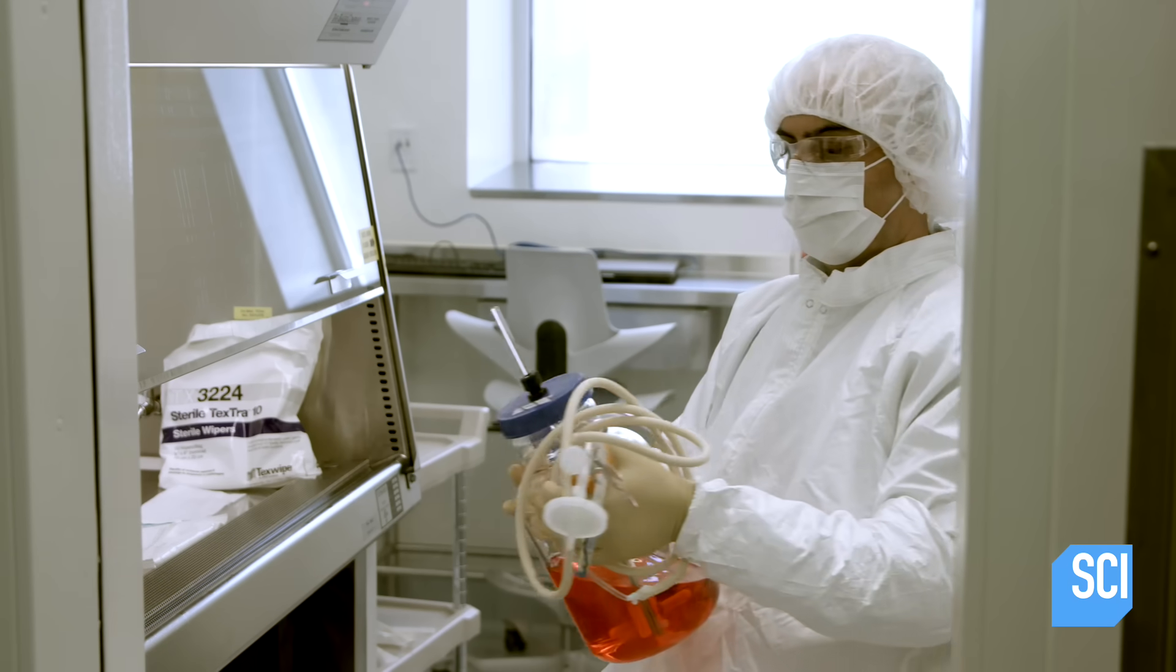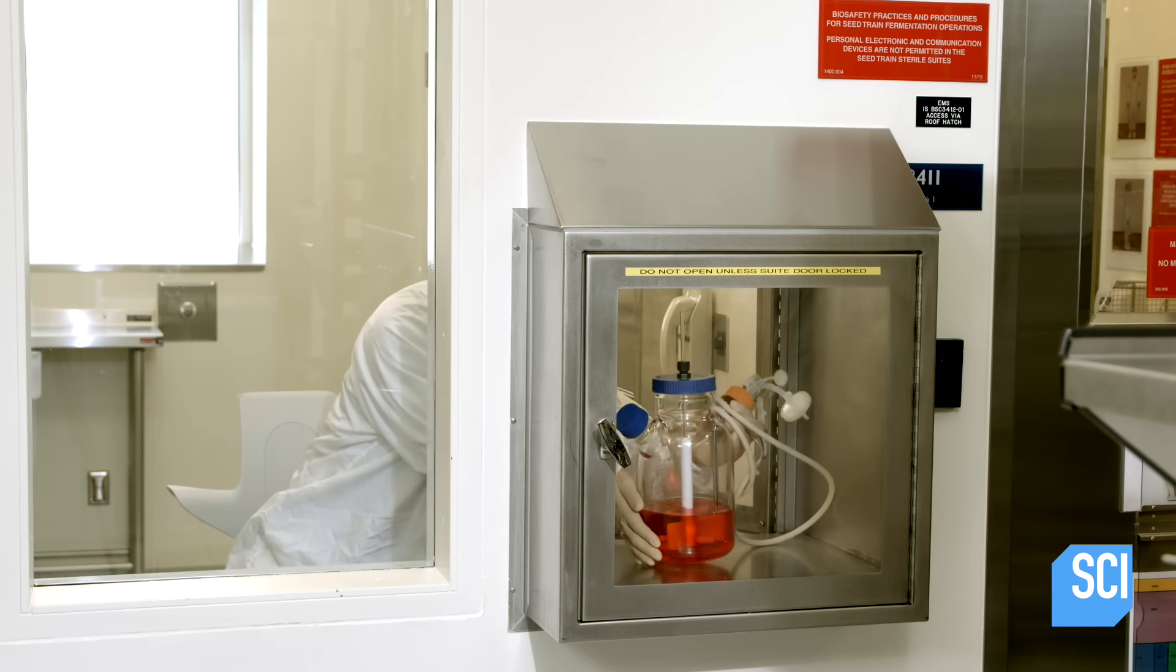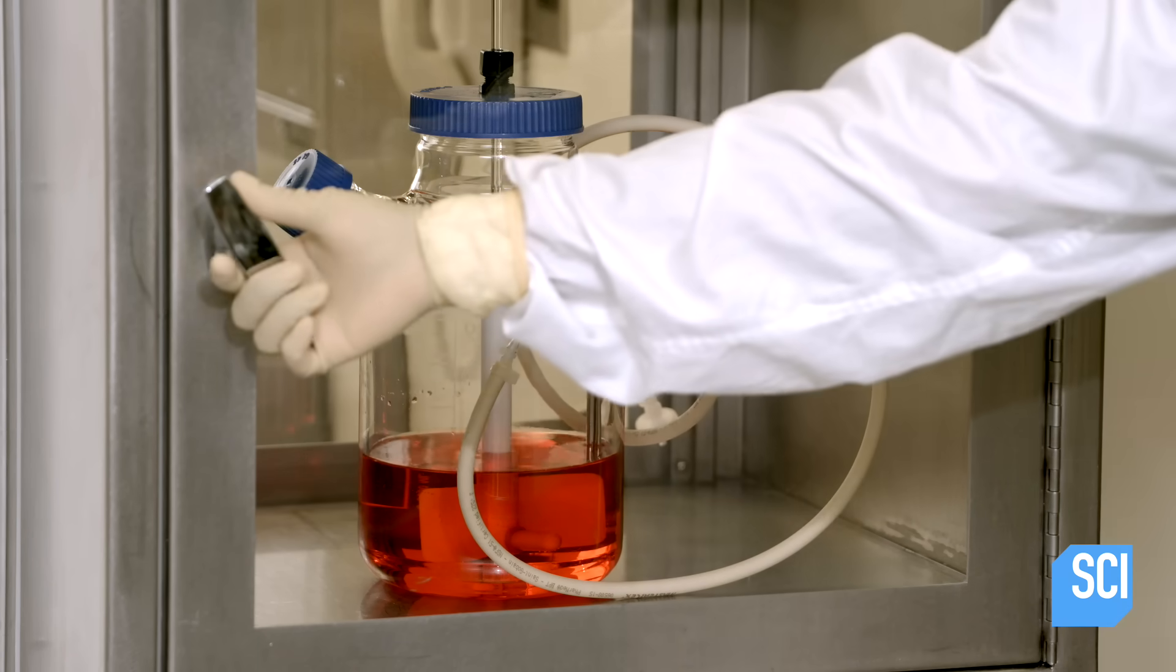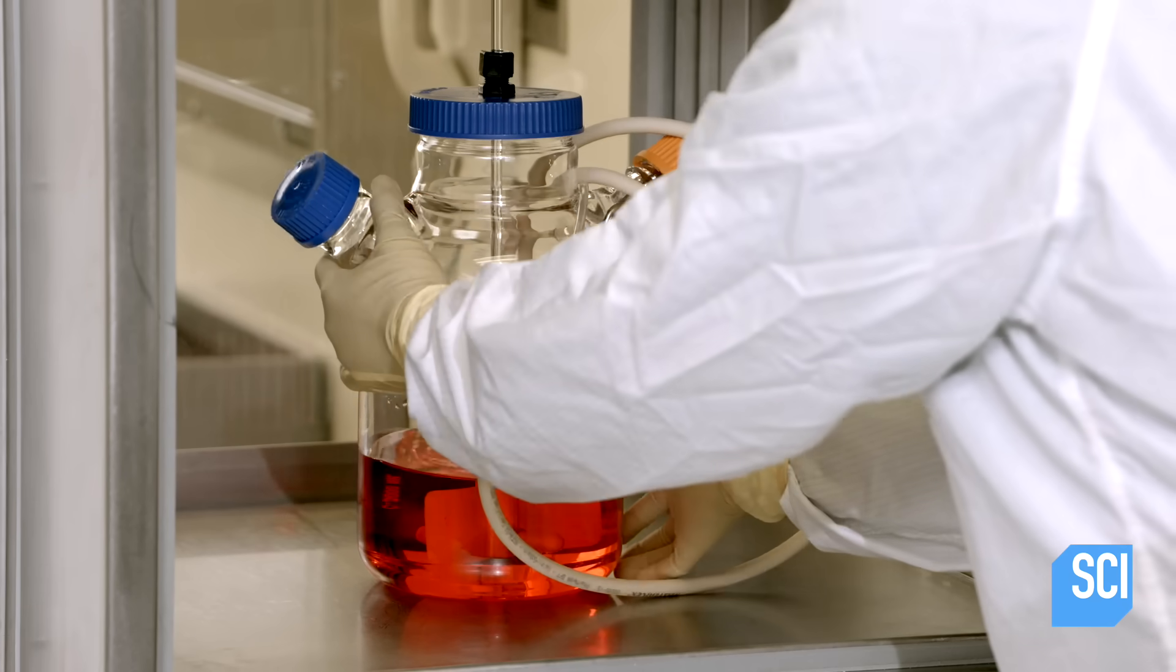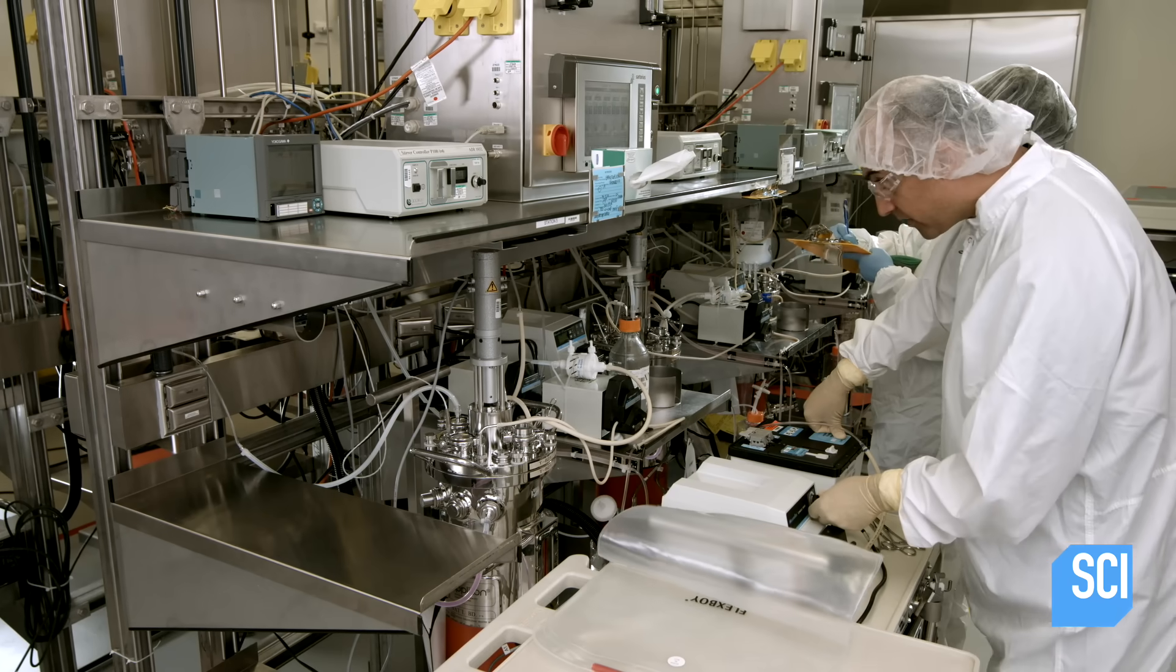It's a recipe to help the cells multiply. A worker transfers the flask that contains the cells to the production side of the plant. The team injects the mixture into a five-gallon capacity bioreactor.